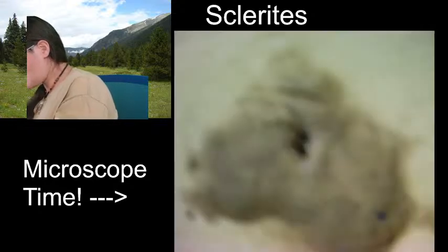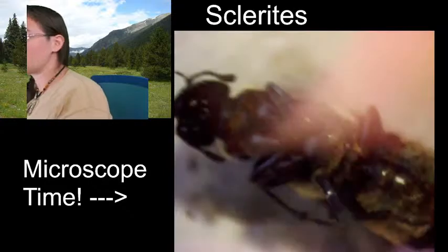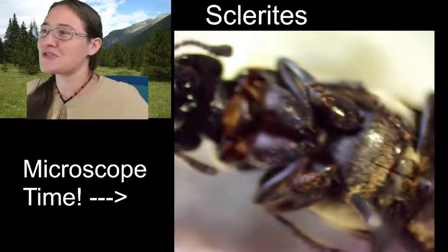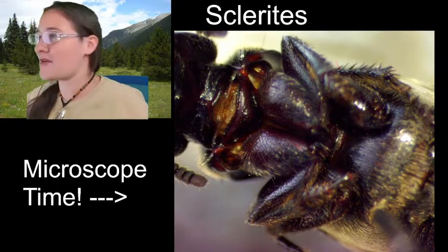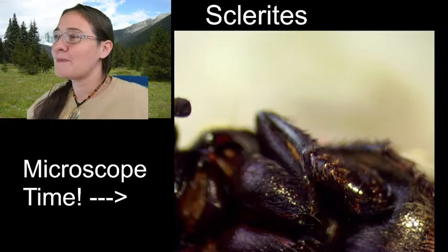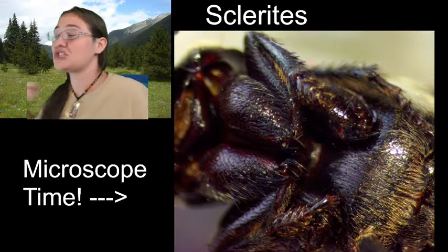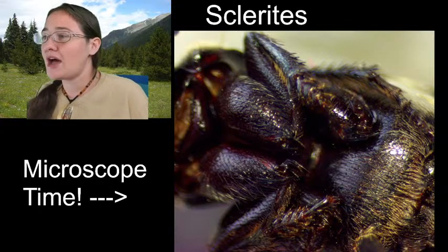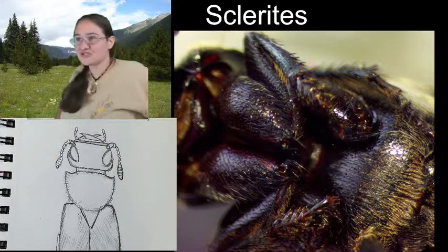I'm just looking to see this first leg. It looks like I'm going to be taking the labels off of my specimen and turning it upside down so that we can check out some of these leg features. Because as an entomologist, there are two types of pinners in the world. There are tuckers and there are spreaders. Generally, I'm a fan of tucking the insects that I pin, just so that they are a little bit safer in museum collections. If all the legs and antennae are tucked into the body, there's a less likely chance of them breaking while they're being moved in a museum or from space to space, right? So I like to tuck, although it sometimes makes it a little difficult to sketch from because you've got to see around those features.